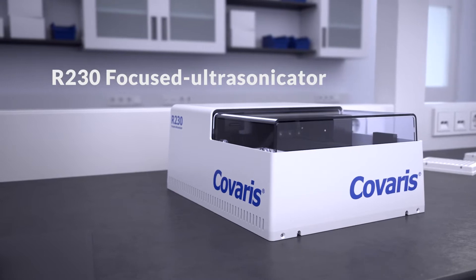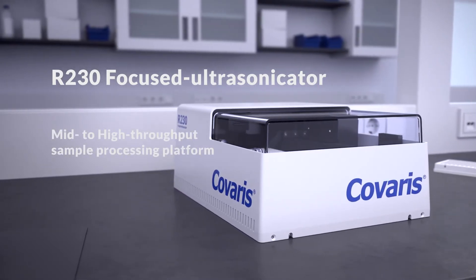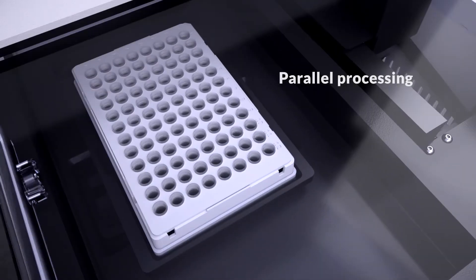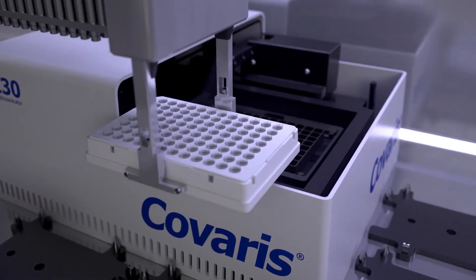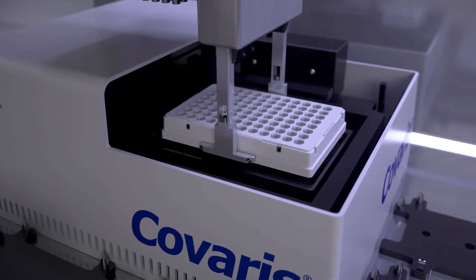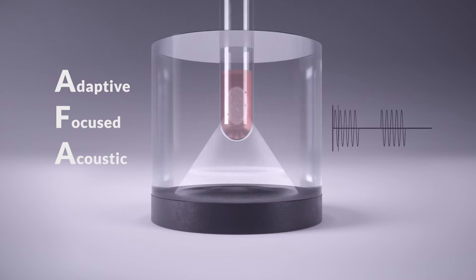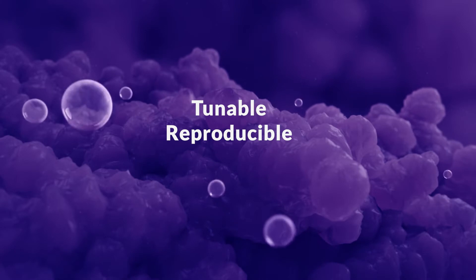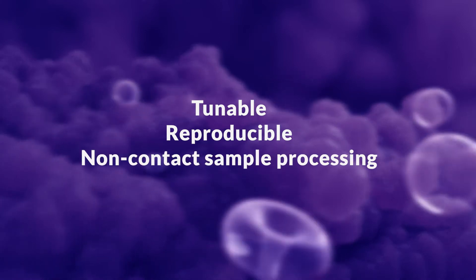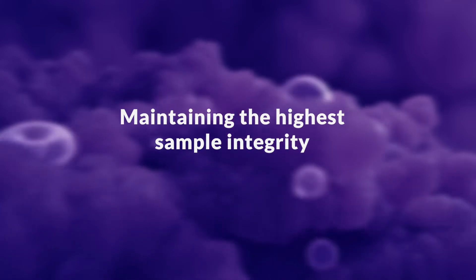The R230 focused ultrasonicator is a versatile mid to high throughput sample processing platform designed to operate as a standalone instrument or fully integrated into an automation workflow. Powered by the patented adaptive focused acoustic technology, the R230 offers tunable, reproducible, non-contact sample processing with isothermal energy delivery, maintaining the highest sample integrity.